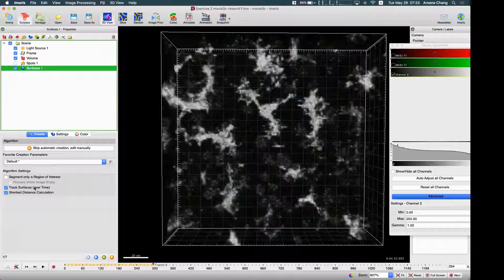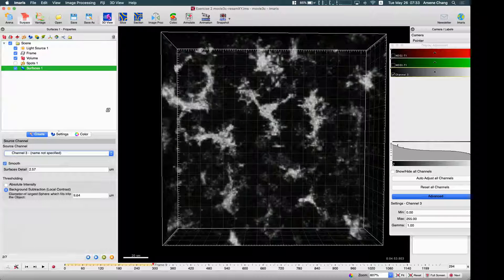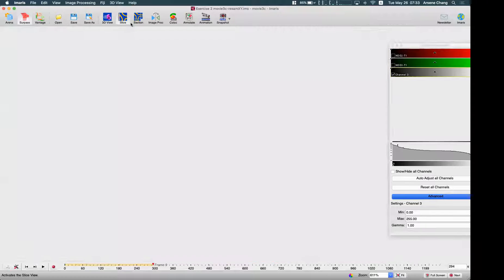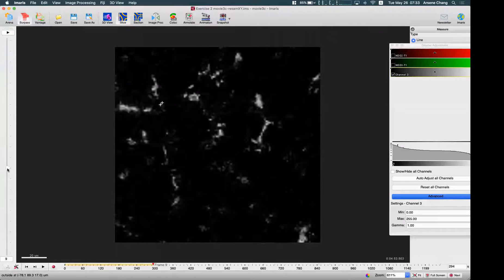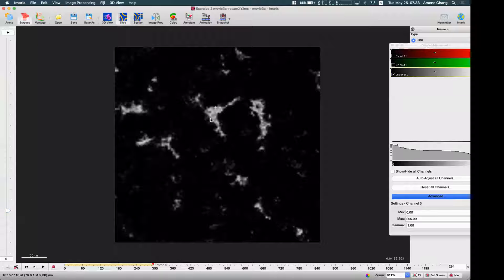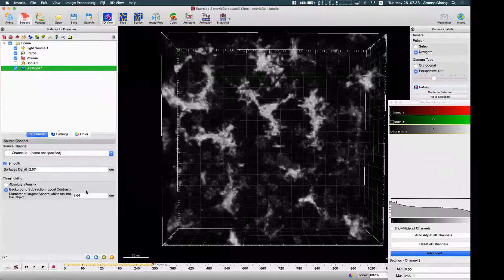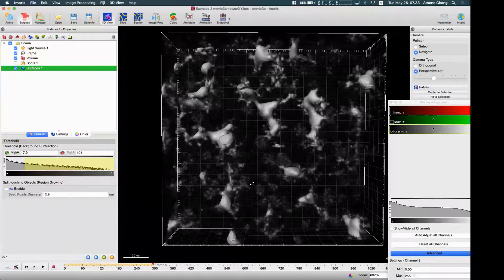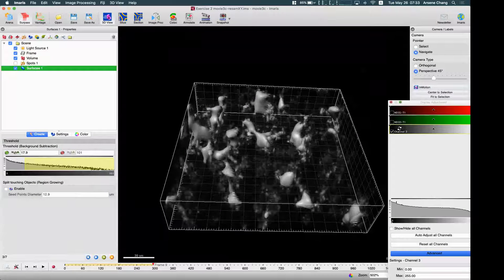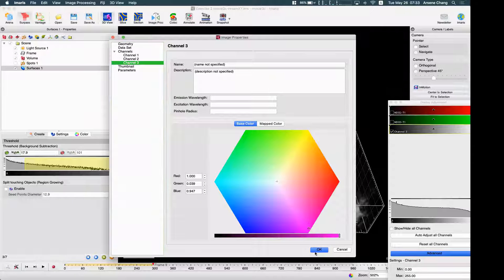For the surface, I'll use 'Track Surface' with shortest distance. For the object size, it looks like about 11, so I'm going to use 10. I may also change the color so it's easier to see.